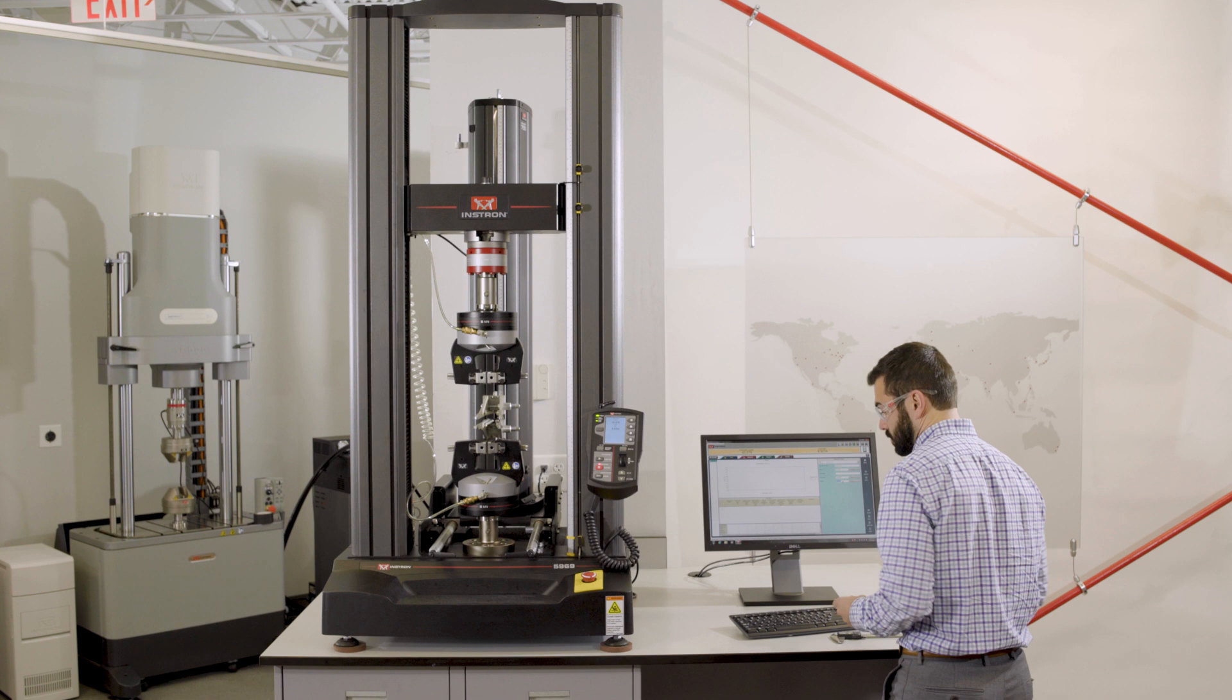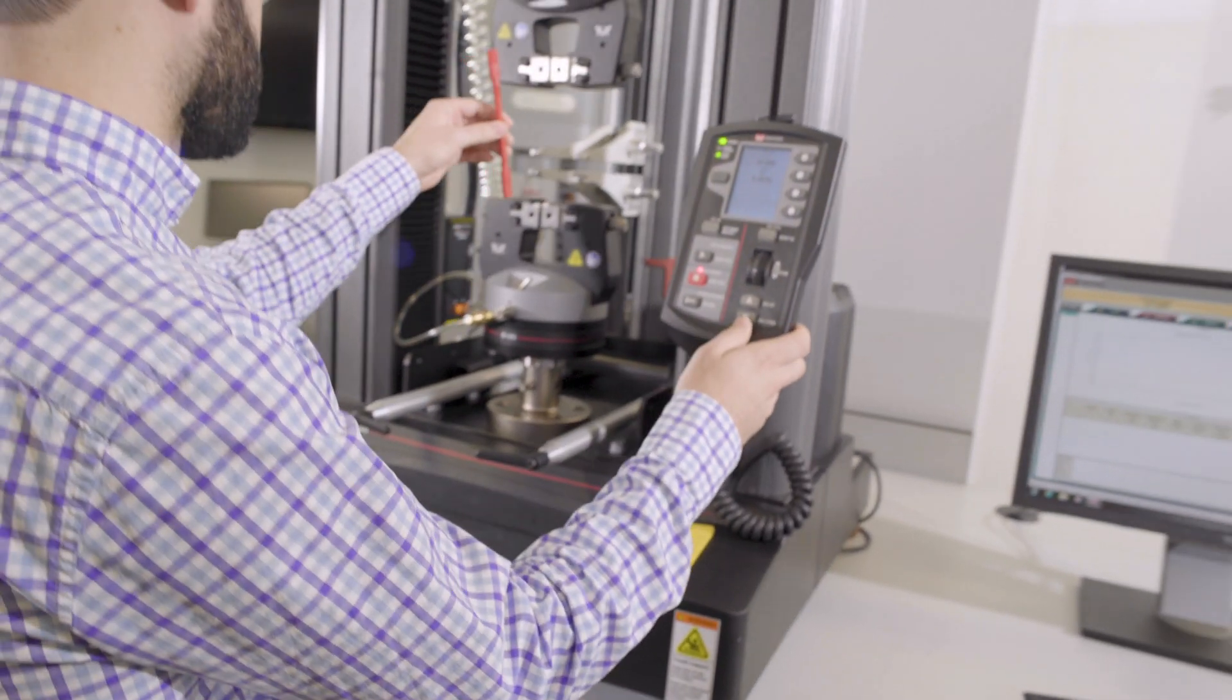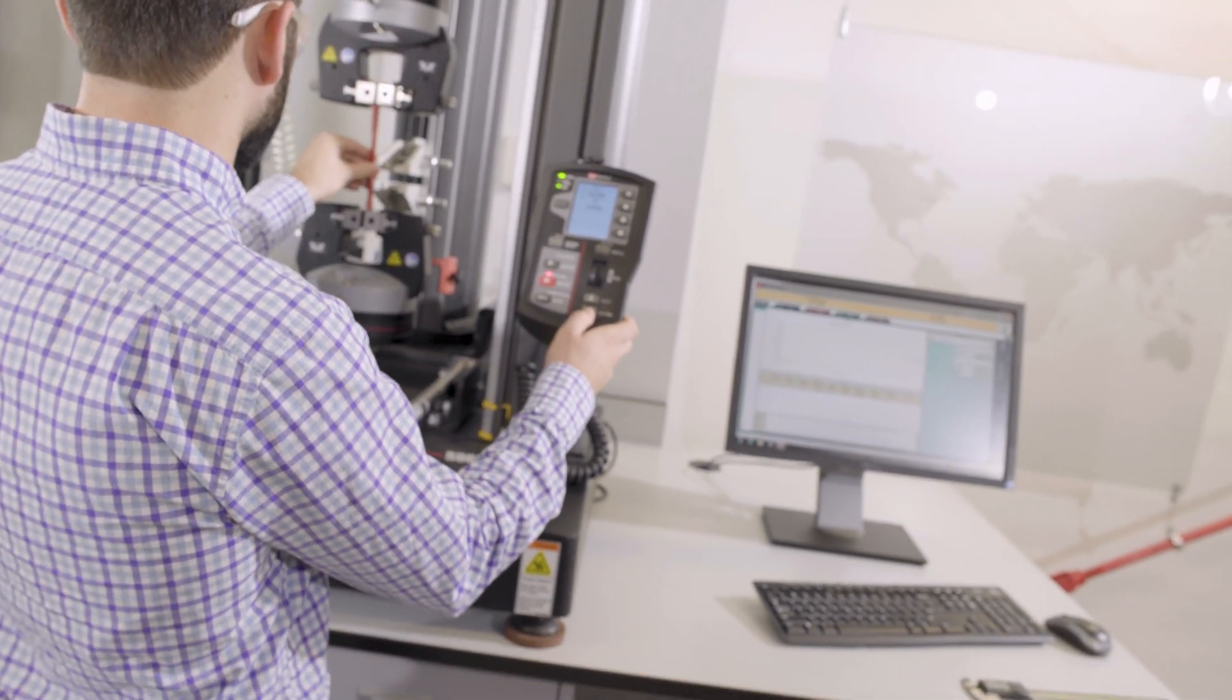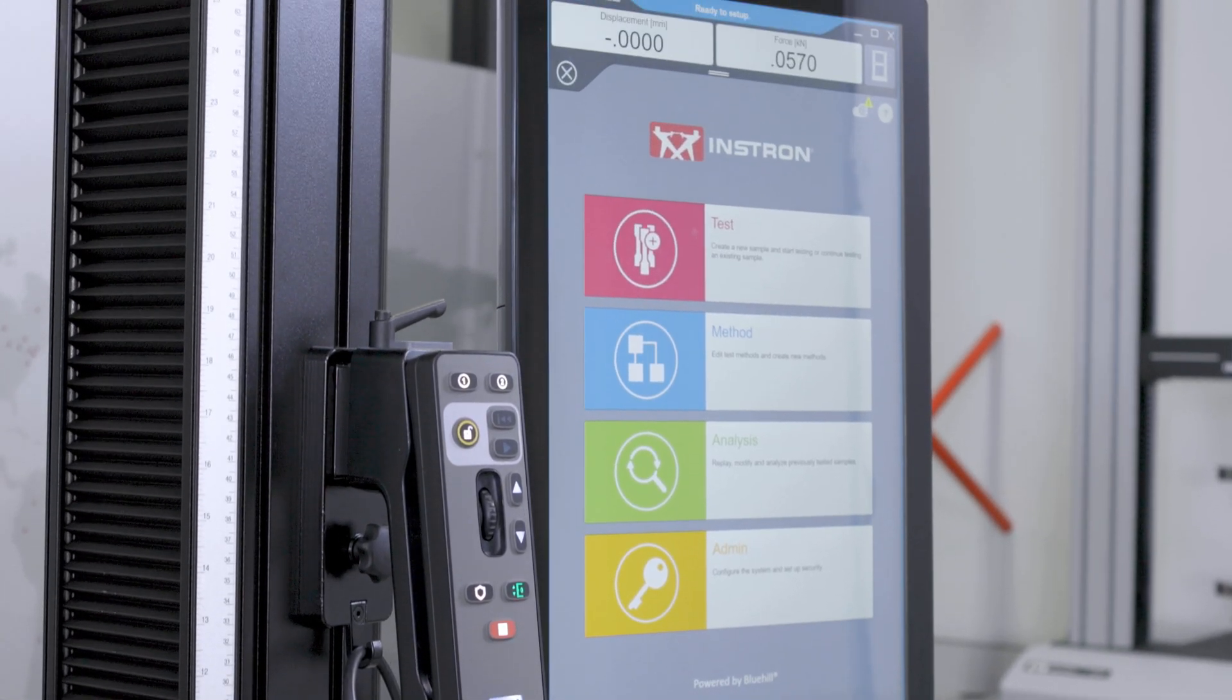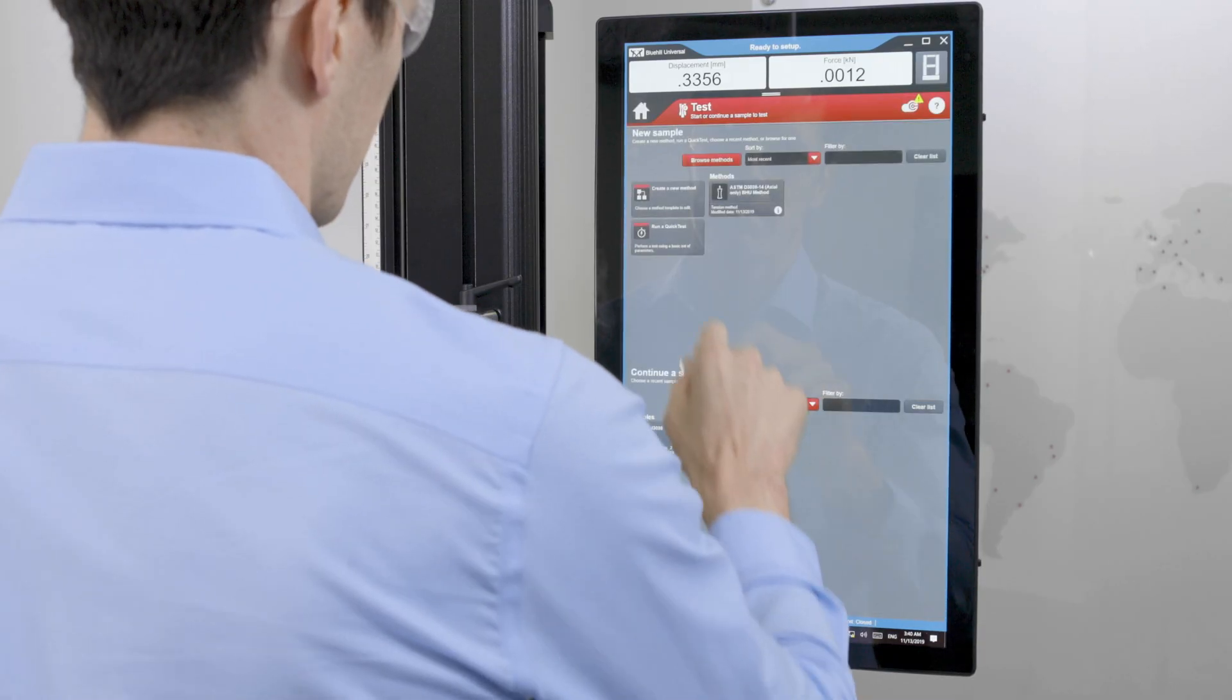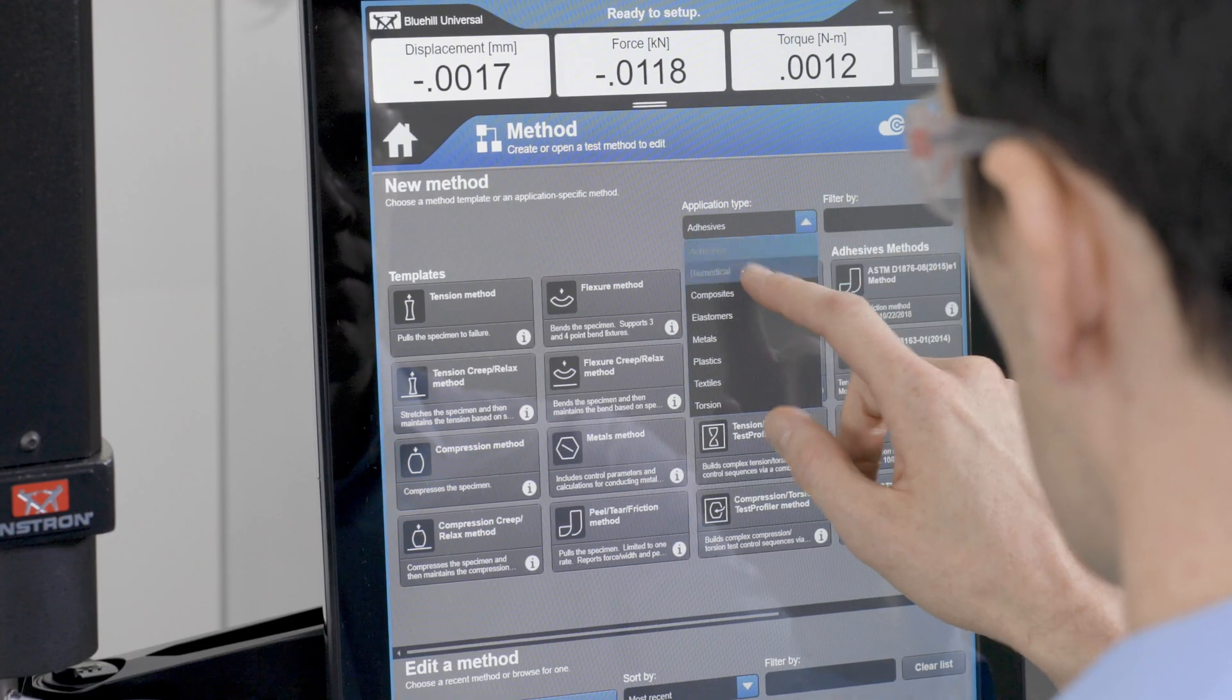Built on the success of over 30,000 Bluehill installations globally, Instron introduces Bluehill Universal, our next-generation material testing software built from the ground up for touch interaction.